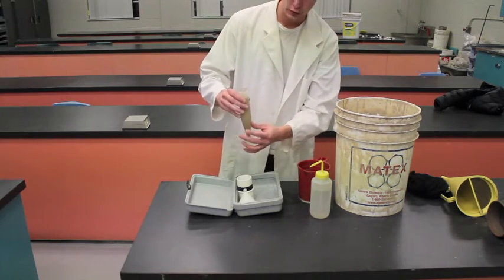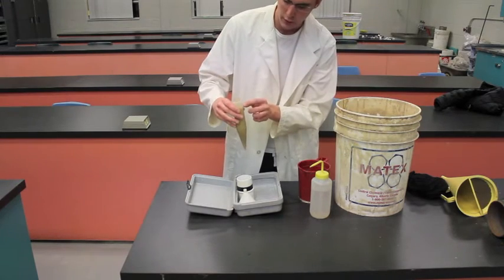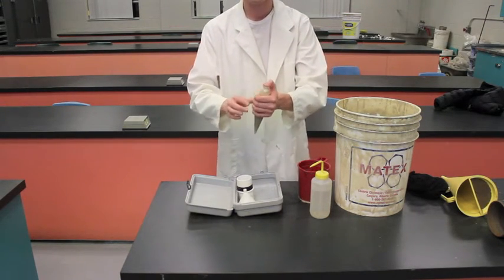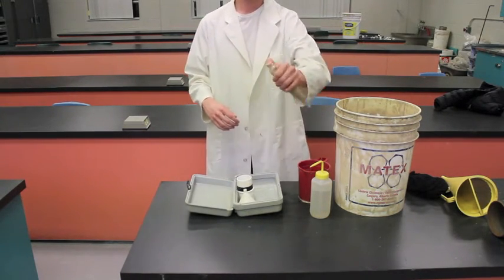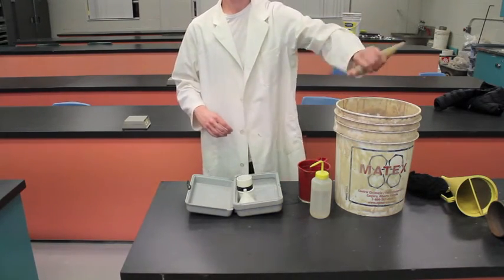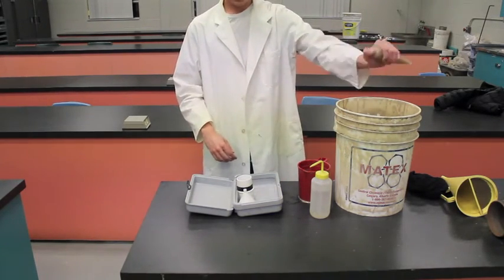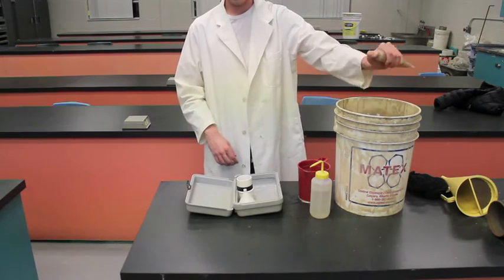And there you have it, so our tube is filled, we have our mud here and our water there and now what you're going to do is you're going to invert the tube and you're going to shake it and this will allow everything to get mixed up and blend with the water and then we'll put it over top of our screen.